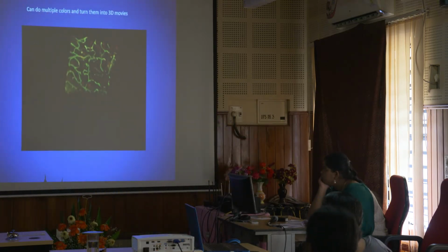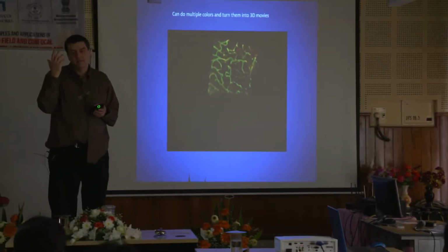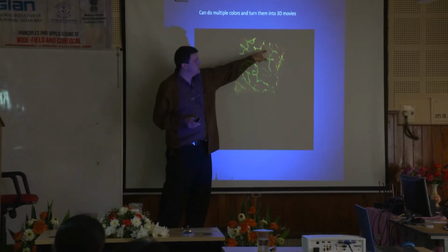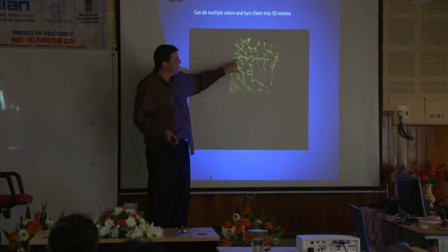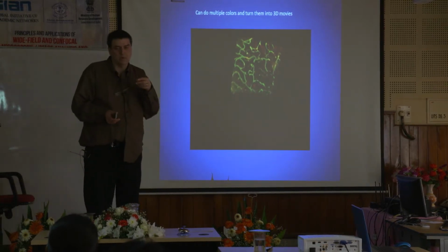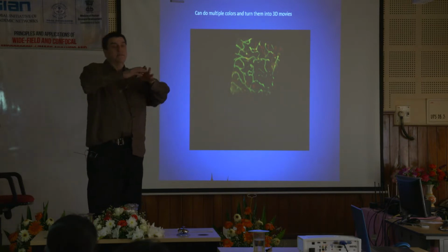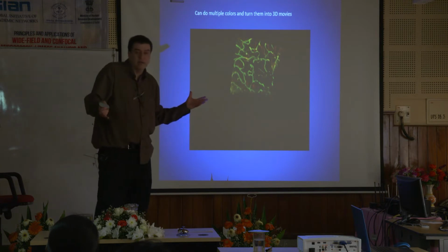What we're actually looking at is a diabetic retinopathy mouse. In diabetes, capillaries tend to degenerate and die in the retina. Because of the way we did it, red are actually dead capillaries, which signify they're gone, whereas the green are capillaries that are still alive. We take a green fluorescent molecule and inject it into the tail vein of the live mouse, so it perfuses throughout the mouse. Obviously, it can't go into dead vessels because they're not functioning anymore.